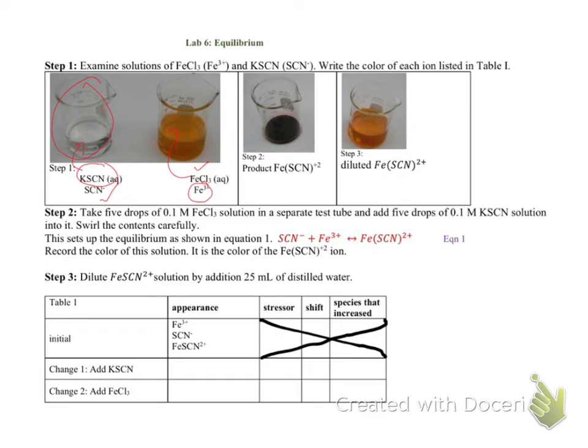The first thing that you have to do is look at this potassium thiocyanate solution. How does it appear? When it says appearance, mostly you explain it with the color: colorless, yellow, pink, brown, and that goes here. So here you're going to write down how ferric ions, which is coming from ferric chloride, look like, and how thiocyanate looks. Again, you answer that in terms of the color.